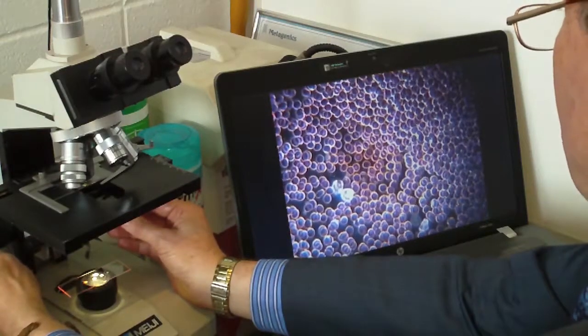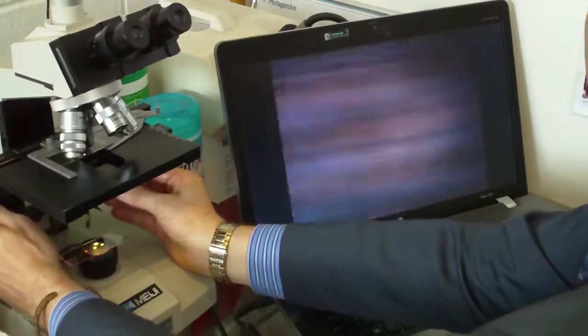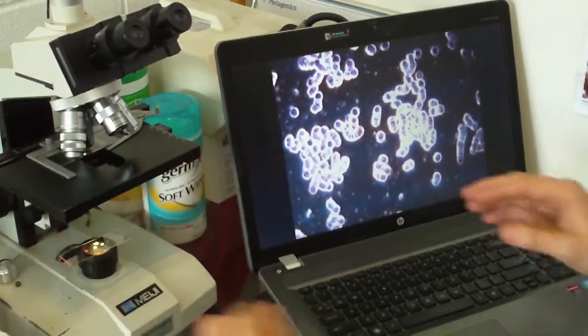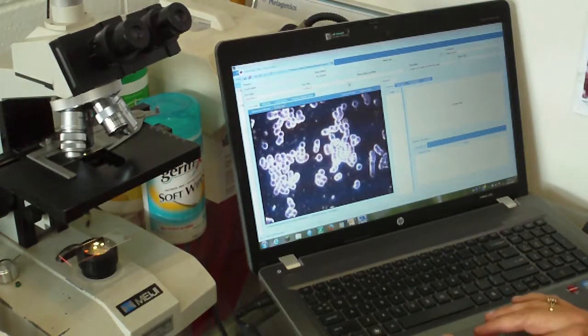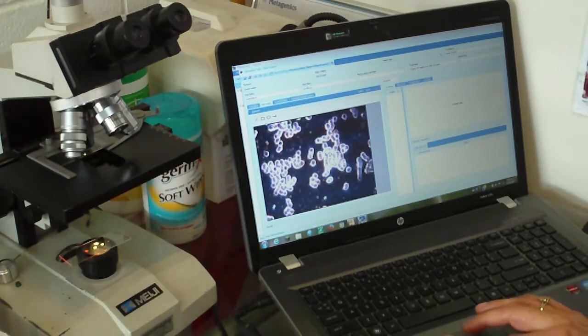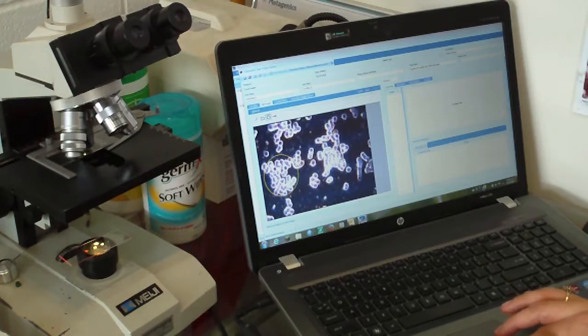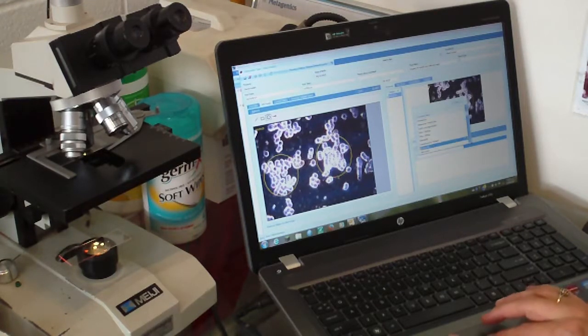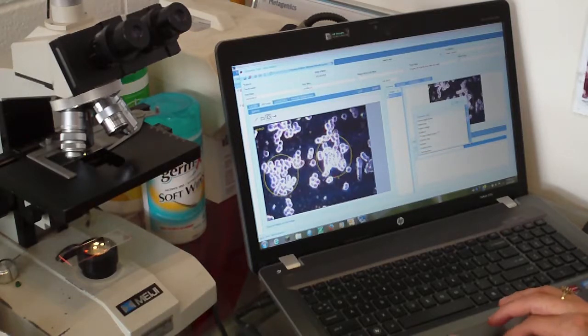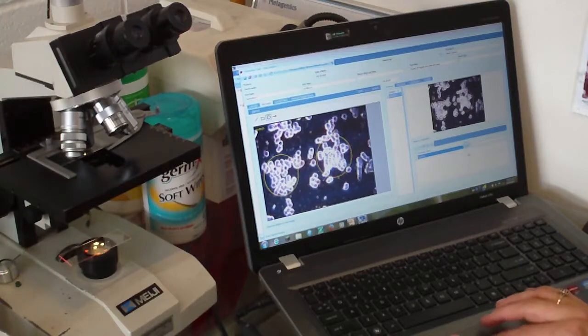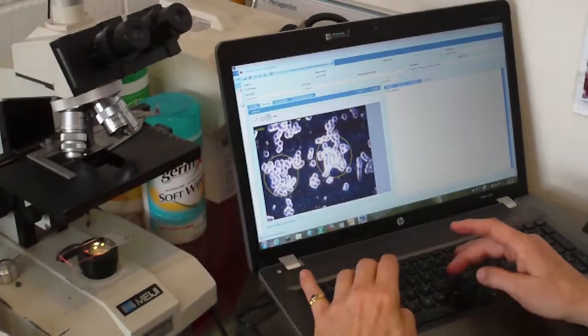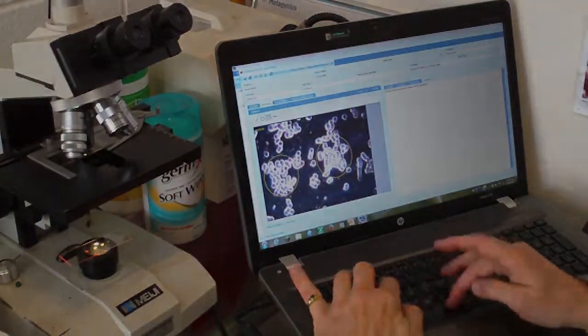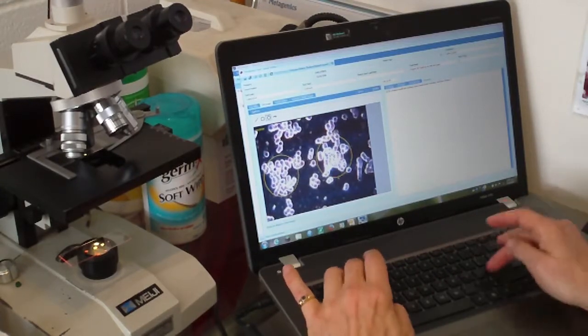I'm just scanning through the blood. Yeah, there's some white blood cells here. So I'm going to snap a picture of this. Because the blood's a little bit clumped, so it shows that this person has been under a little bit of stress recently, and they may be a bit dehydrated. There can be other reasons too. So if you see the program, very good program technology from Metagenics enables me to save these images. So really that's almost like erythrocyte aggregation, but I'm going to call it Rouleau because it is closer to Rouleau. And it's moderate.